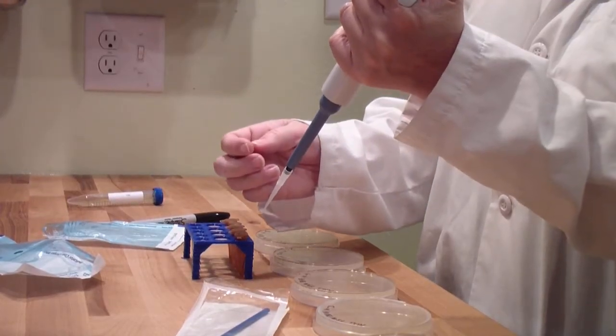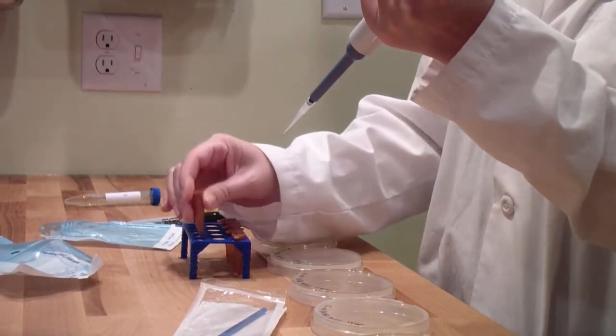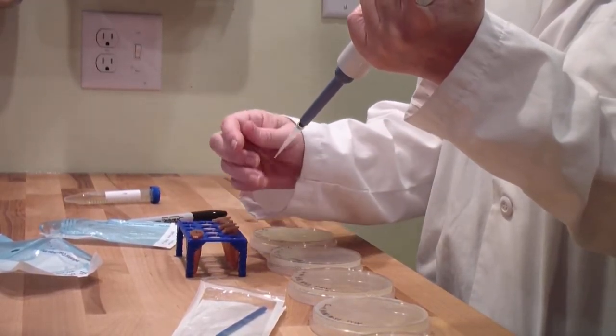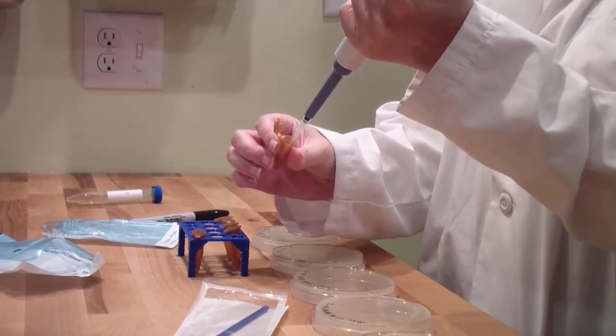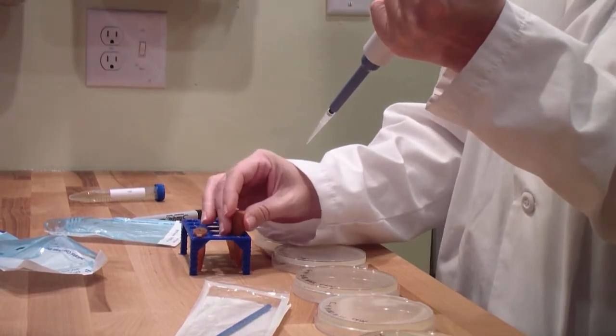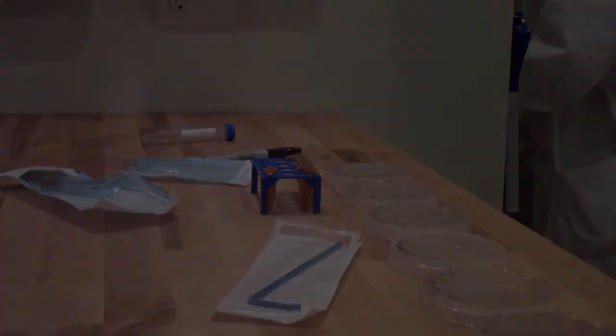Take ten microliters from the ten to the negative one tube and transfer it to the second tube labeled ten to the negative two. Mix with the pipette by moving the liquid up and down with the first stop until you have mixed five to eight times. Empty the tip by going to the second stop and discard the tip.